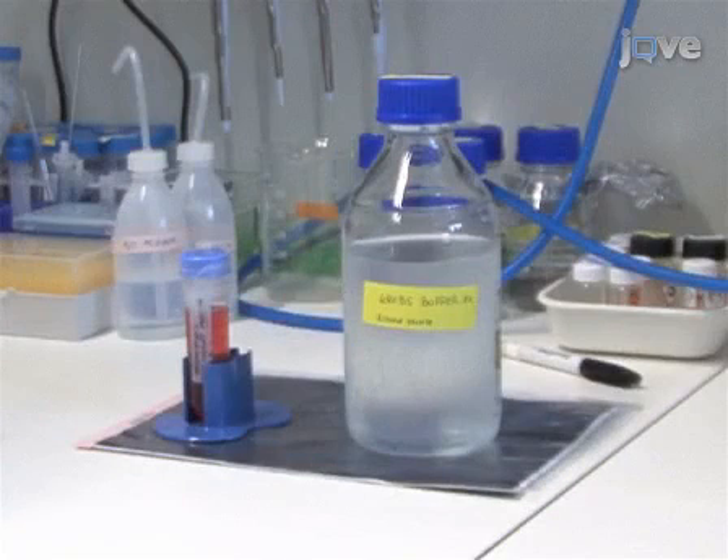One day before the dissection, prepare 1X Krebs buffer and the culture medium according to the accompanied manuscript.